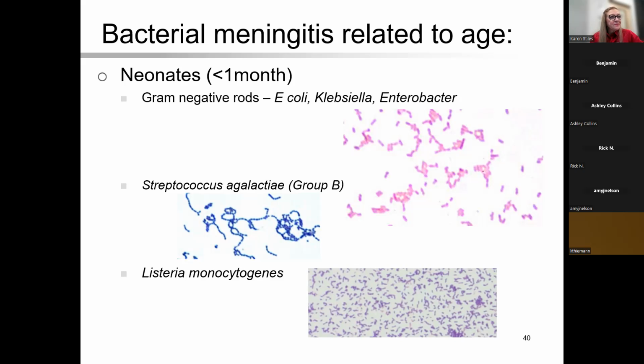Becky: I also wanted to add that when you're training a new employee, you probably should, just like that, have a box of slides sitting there for that new employee to go over and read them and write their results out, and then see if it compares to the results that were sent out by the laboratory. Exactly.